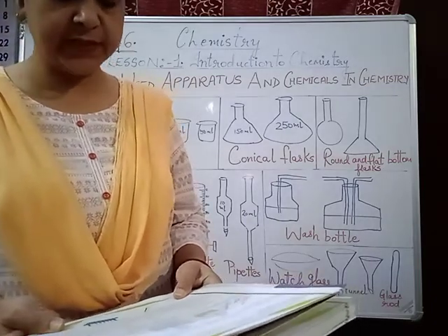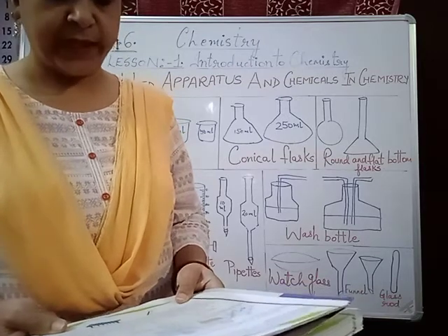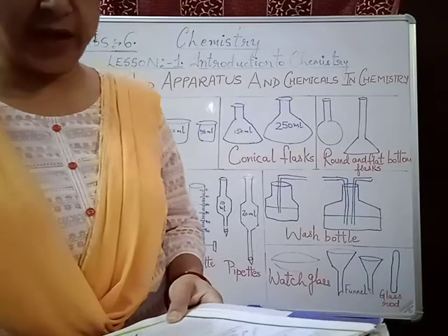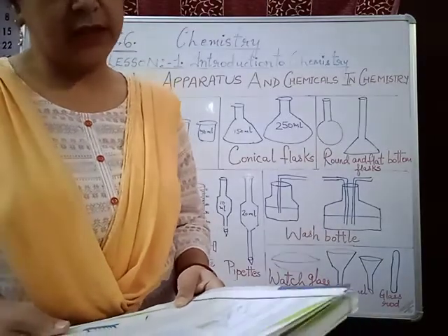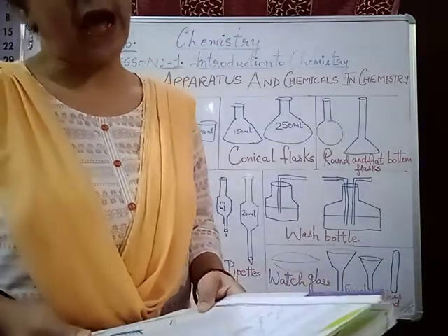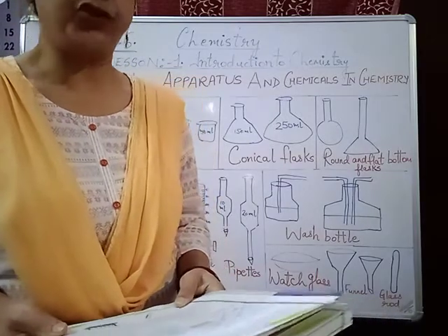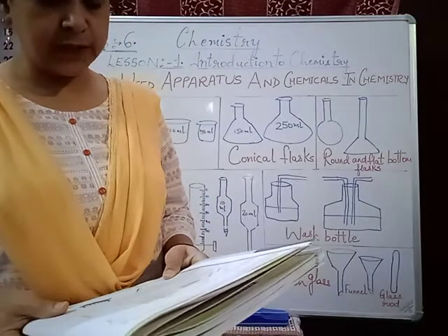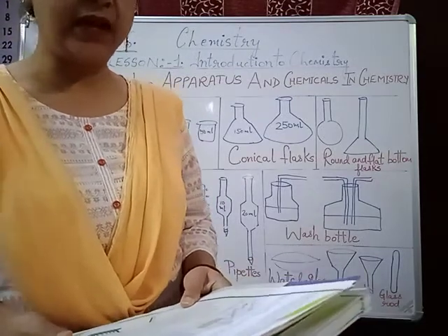Test tubes. It is a glass tube. It is closed at the bottom. Its capacity is generally about 18 ml. The test tube, children, in which a chemical reaction takes place, is of 18 ml. It is used for holding and heating the substance.